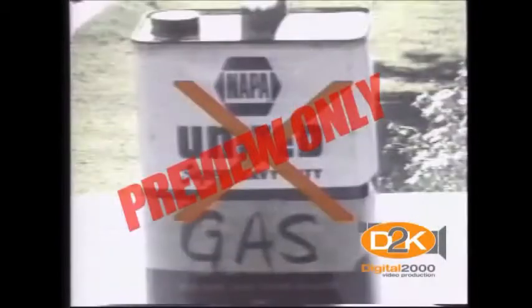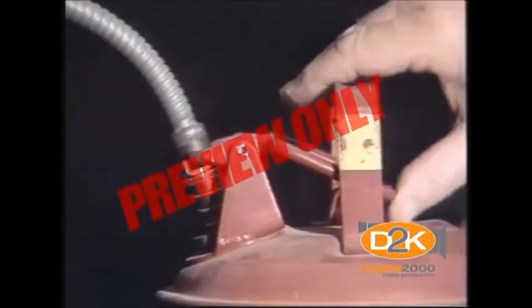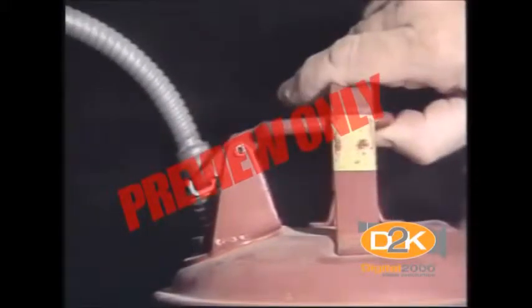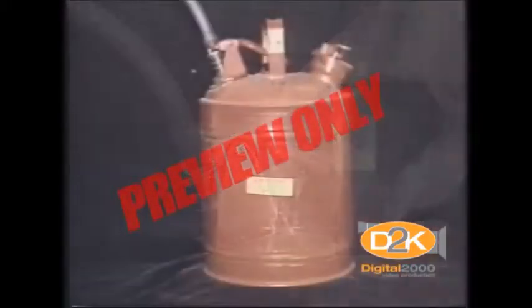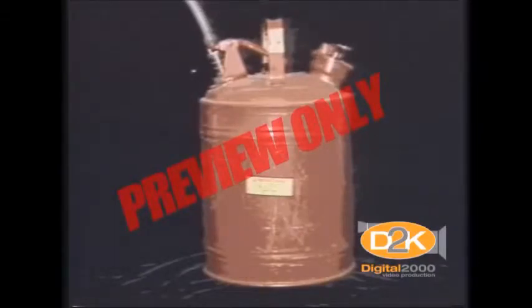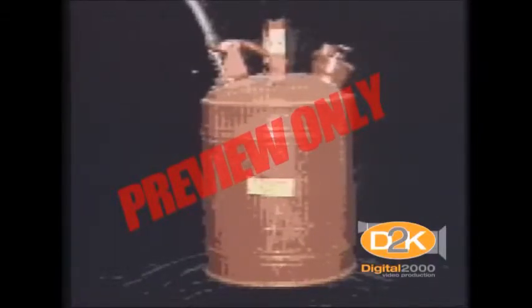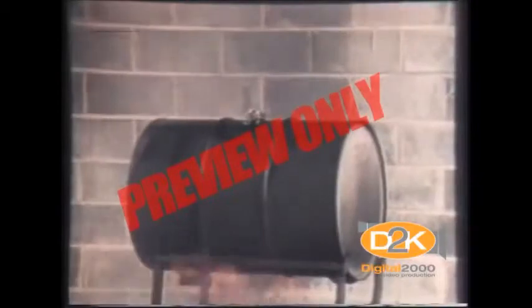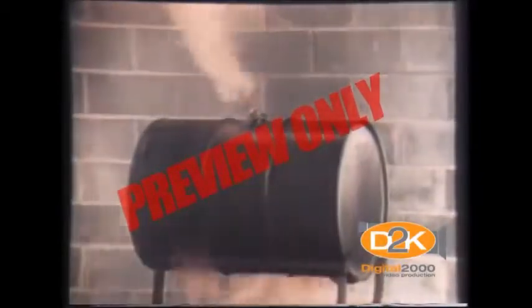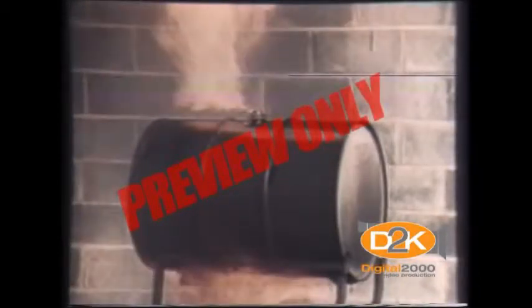An approved safety container has a spring-loaded lid which prevents spills, but it also allows the container to breathe. As you know from your classroom studies, when the temperature of a substance is increased, its molecules are made to jiggle faster. The increased collisions between molecules force them to move farther apart, resulting in an expansion of the substance. If you fill your gas tank, then allow the car to sit in the sun, the tank may overflow due to the expansion of the liquid.